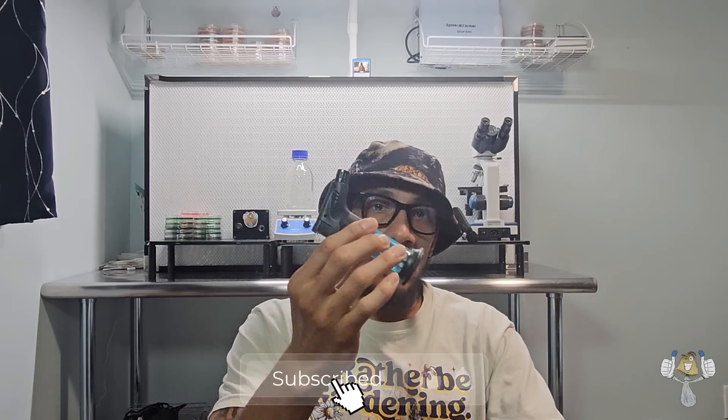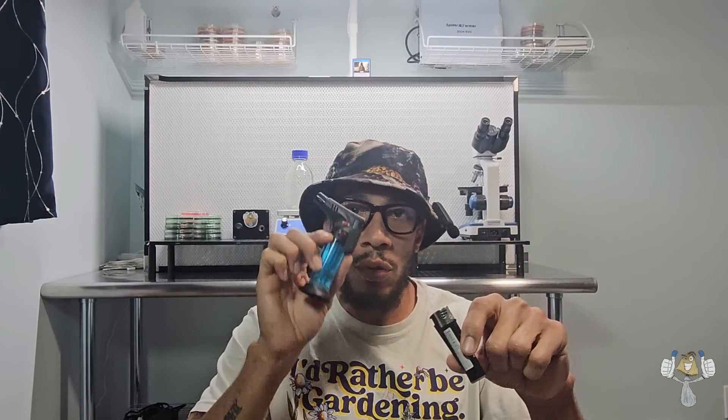A lighter and a torch. We're going to need either or, because we need to sanitize our syringe needle — we need to burn it and get it cherry hot so we know we're working with a clean needle. You can use a Bic lighter; it just takes a bit longer to heat up. I use these torches. There's also a coil induction method for when you get more advanced, but in the beginning a lighter or a torch will do.